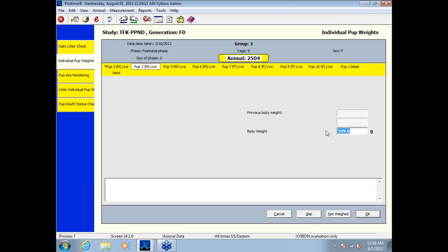I don't have weight checking set up for this. I also have my measurement to 1 decimal place. That's where you see your rounding. So these are all different business rules that you can set for your actual work process.